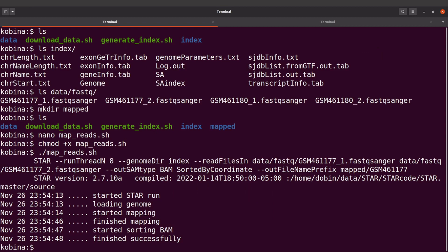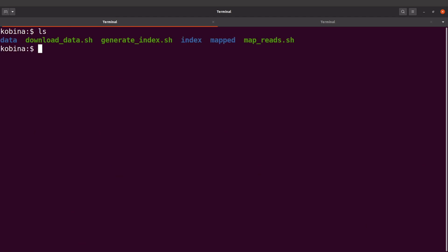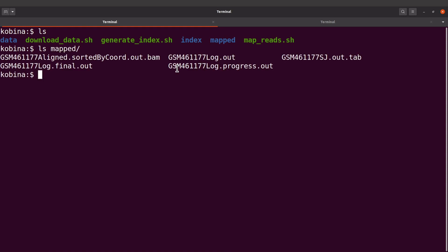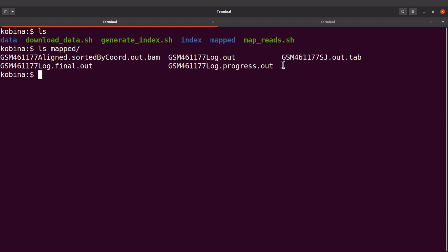STAR has finished mapping the first sample. Let's check the output — I'll do ls mapped to see the directory contents. I have the output files here. This is the BAM file and we also have some log files. I've already explained these output files in another video, so you can check that via the link. For this tutorial I'm going to focus on the BAM file.